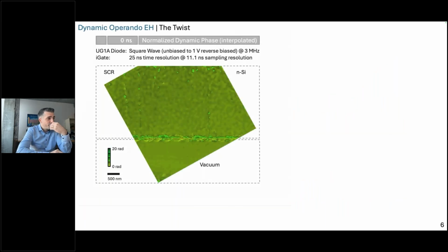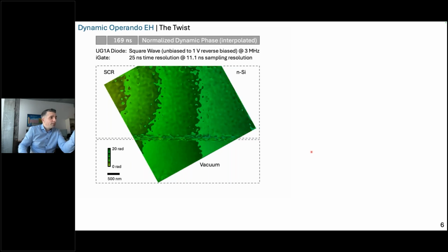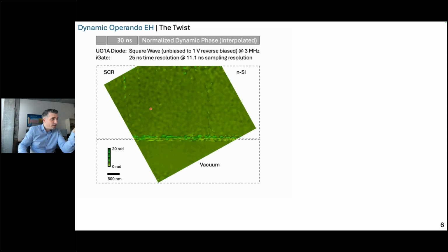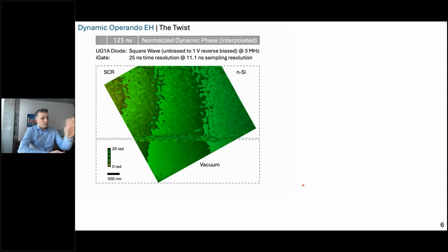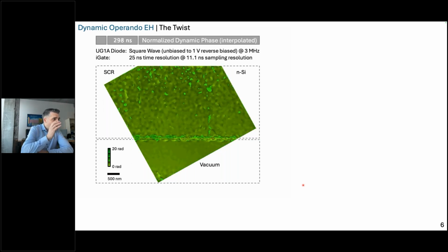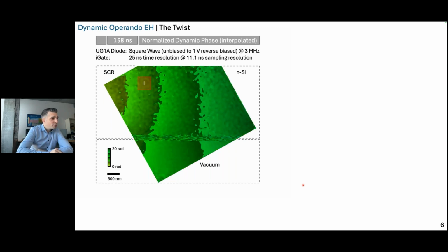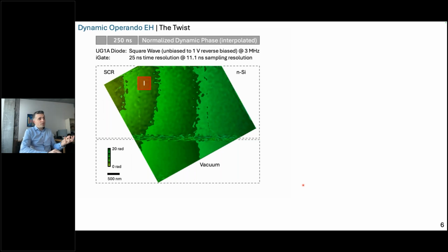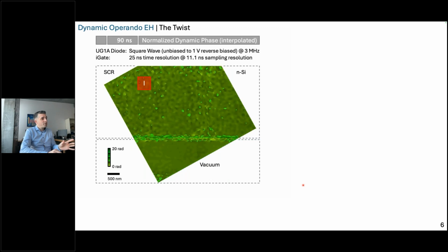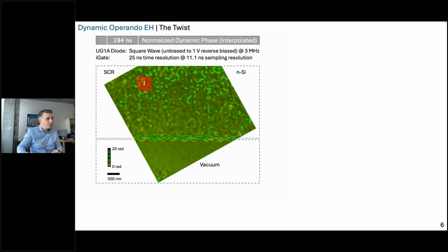So here's the movie. You can see we start with the unbiased state, and then the phase slope is coming in, and then it's leaving again. Now, just let's play that in the background. It's not important, but what we know is that we have different parts in our specimen, different regions. So the first region is deep inside the space charge region and as deep as possible for this field of view inside the specimen, according to the edge of the specimen here.